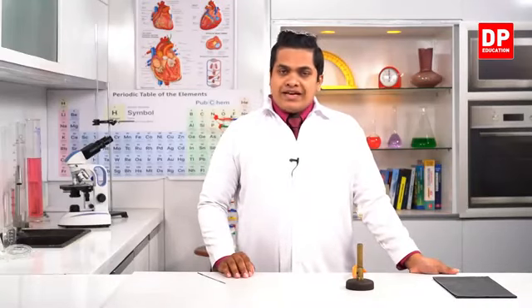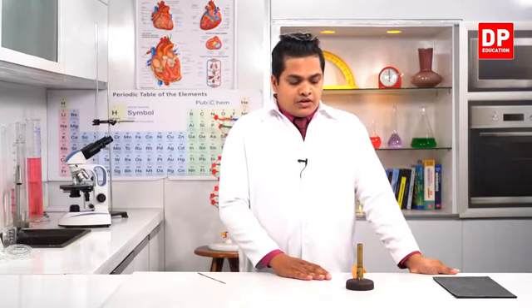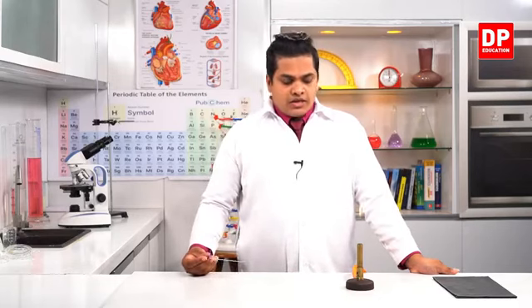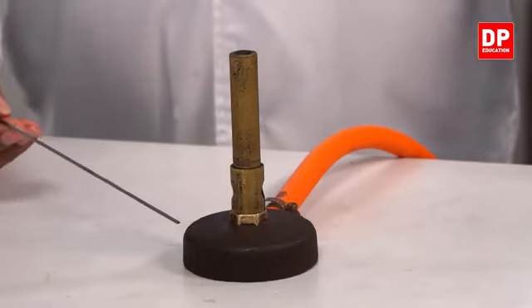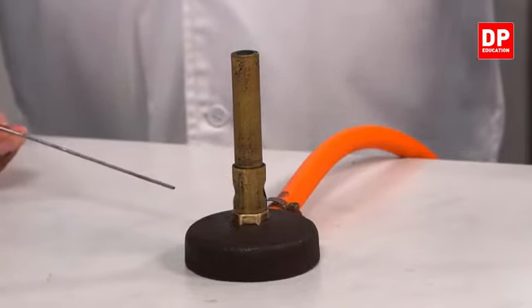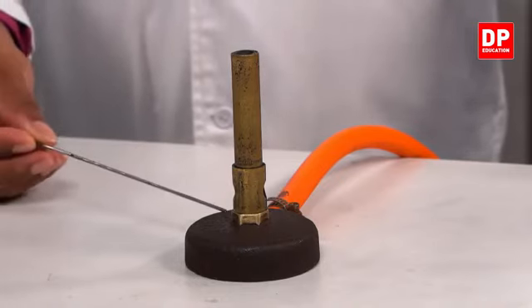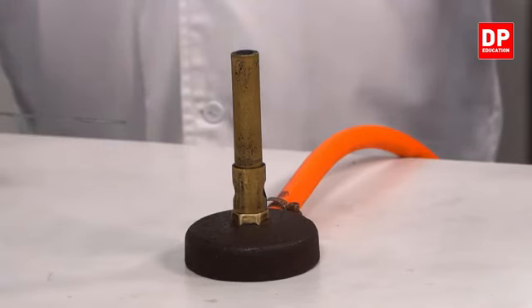Right, my dear children. Now then, in this activity, we'll be identifying several zones related to a Bunsen flame. So I have a Bunsen burner with me right now. If you take a Bunsen burner, we can identify these parts. This base helps to fix the Bunsen burner on a tabletop like this, or on a surface, to keep the Bunsen burner rigid. So the base can be used to keep the Bunsen burner rigid.